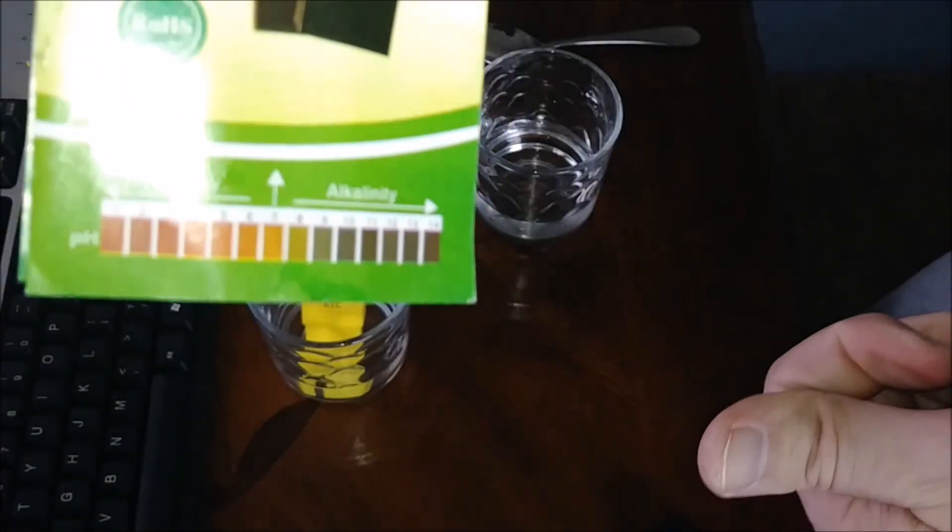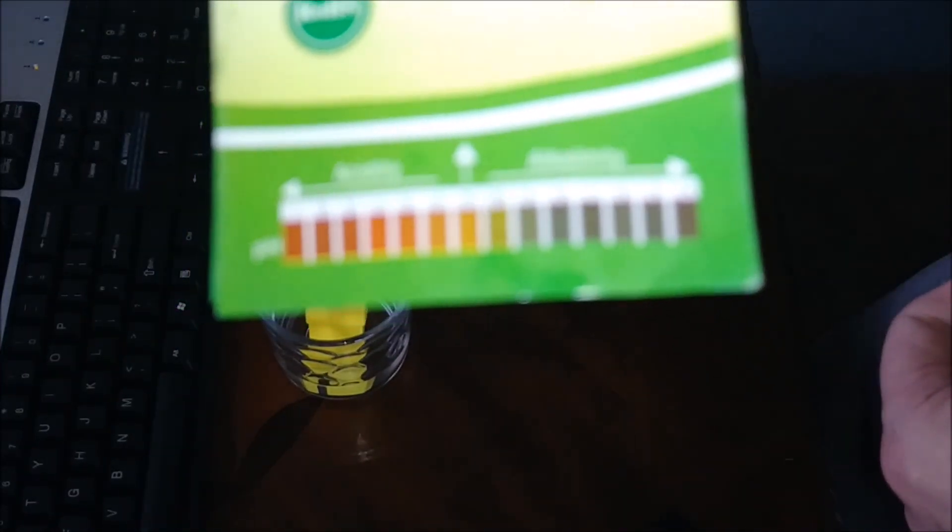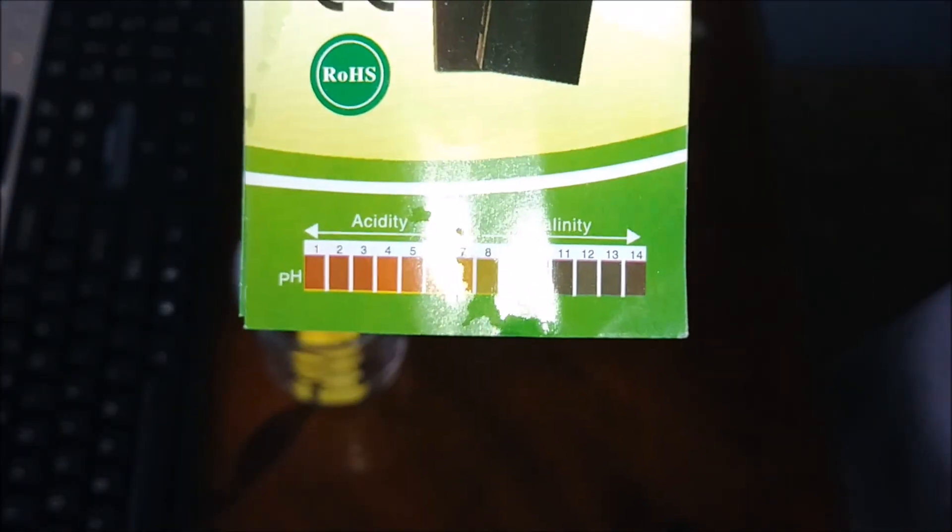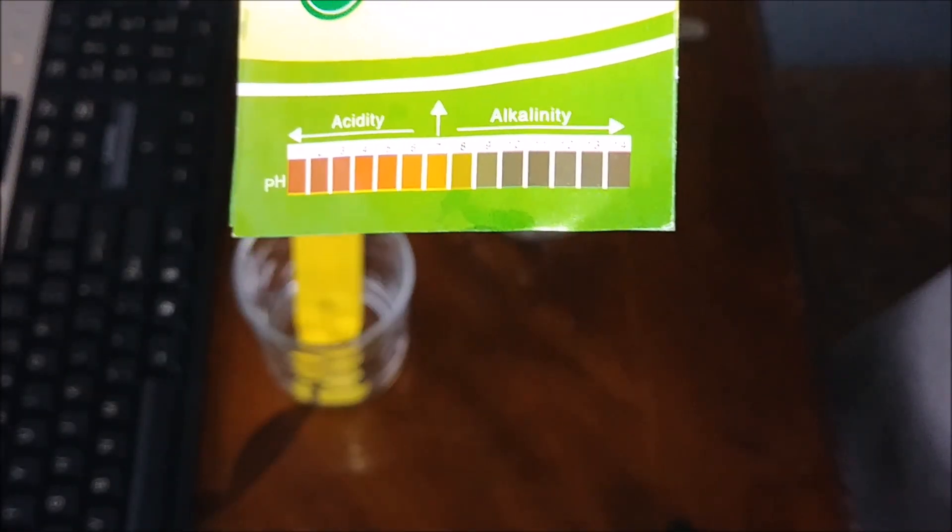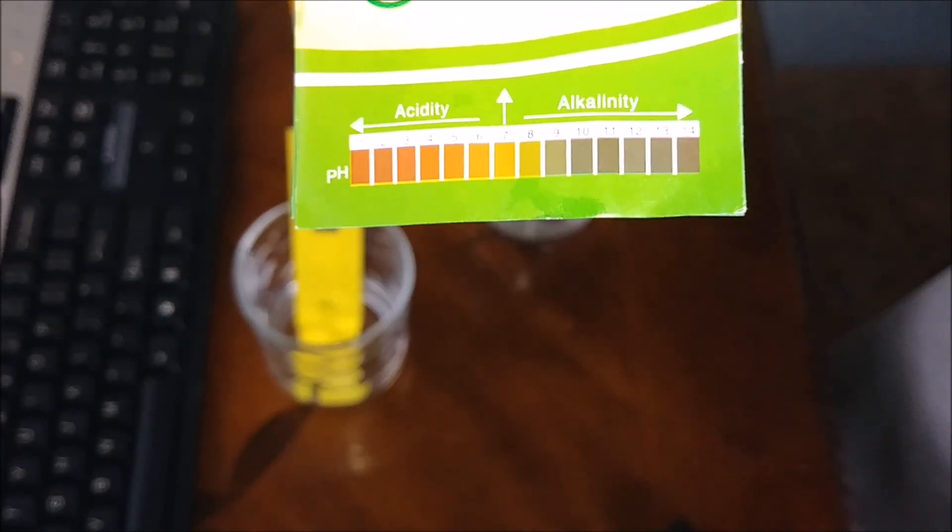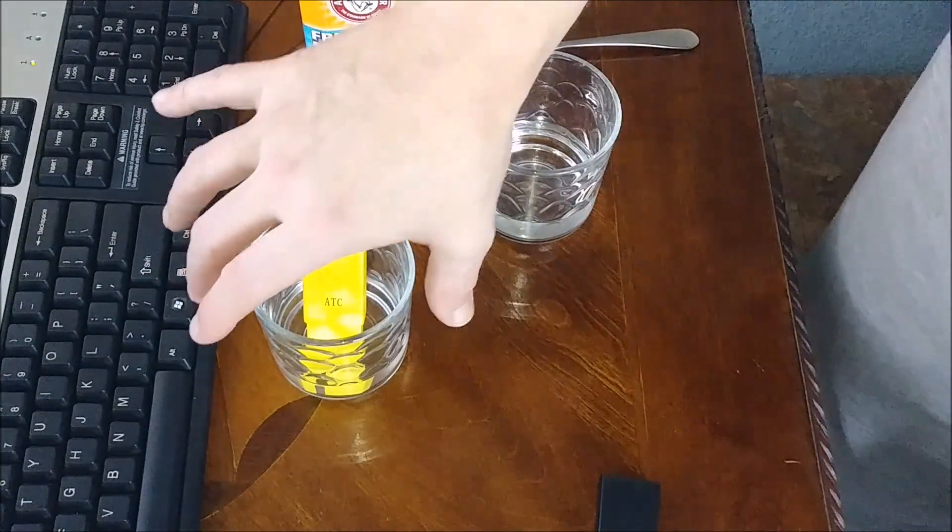There's a scale right there for your actual pH, like you would have for an aquarium or something like that. There's a scale from alkalinity to acidity.